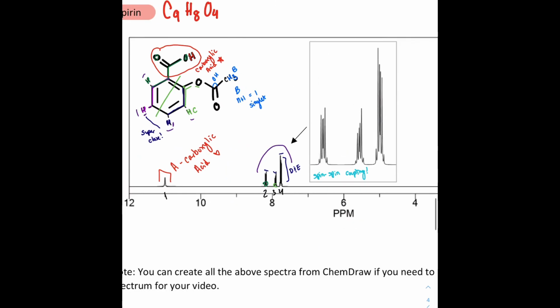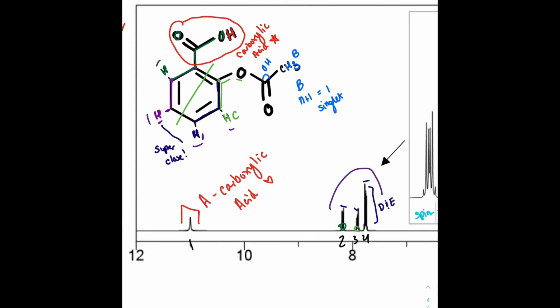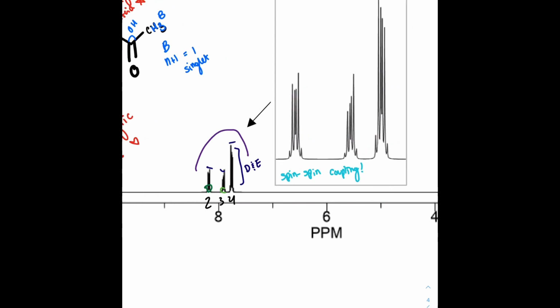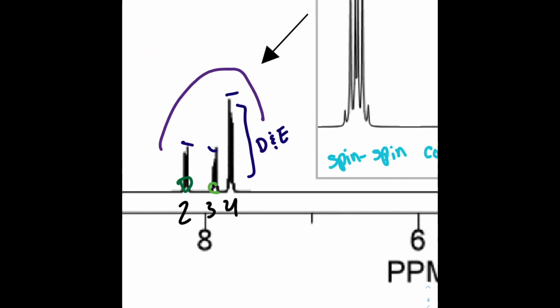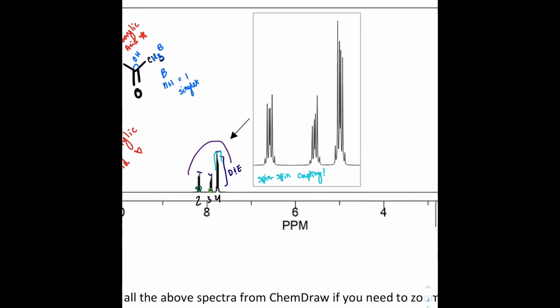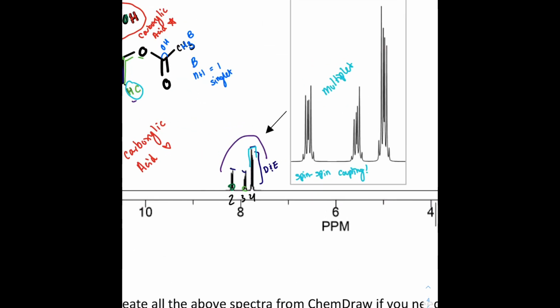All of these, the electrons interacting around all of these hydrogens are so close together that they kind of get all mixed up, and especially in D and E, where there's a literal overlap in the peaks, it just kind of causes weird stuff to happen, and so all of these end up being multiplets, even though hypothetically it should be doublets.